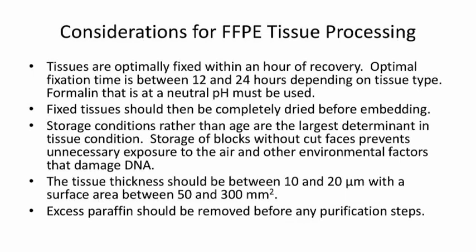Optimal fixation time is between 12 and 24 hours, depending on tissue type. This can be important. In some of this work, we've found that there are cohorts of tissues that, if the surgeries were on Thursdays or Fridays, sometimes they were allowed to fix over the entire weekend. And those are significantly different than tissues that were resected during the week and only fixed for, again, overnight or for 24 hours. And the other absolutely critical part, again, probably obvious to most, is that formalin at a neutral pH really has to be used. If it's an acidic formalin, it just destroys the tissue.